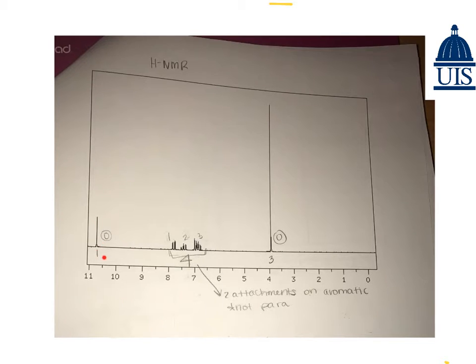According to the integration number as well, for this peak we see that the integration number is 3, which means that we have a CH3 group because we have 3 protons, and because it is one strong peak, we know according to the N+1 rule, we have 0 neighboring protons.